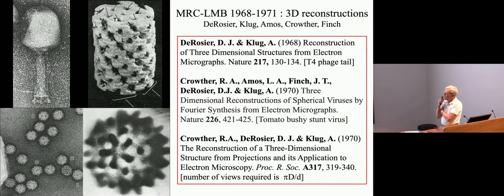And I think it was Aaron and his early collaborators like Berger and Finch and so on, who went to a lot of trouble to prove that these images were essentially projections through the entire thickness of the structure, whereas other people thought they were looking at the surface. And then they had all sorts of papers that are not cited here to try and justify that. But in the end, that became the established dogma.